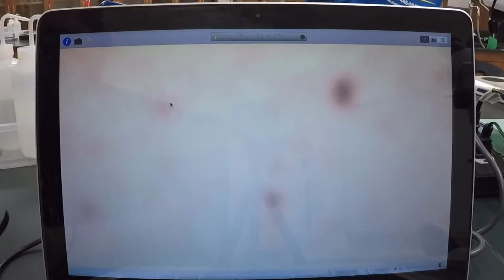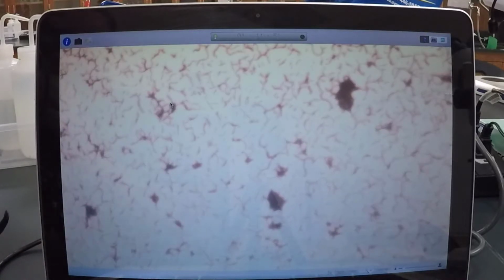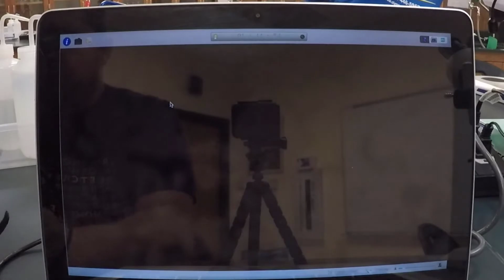Now, the difficult thing about bacteria is they are extremely minute organisms. So you need to go all the way to 1,000 times your eyesight, and even at that, they can be fairly difficult to see. So here you can see splotches. Those are huge amounts of bacteria. So I'm going to continuously zoom in until I get to a place where I can go to oil immersion, and then I'm going to go to oil immersion, and you're going to see this.